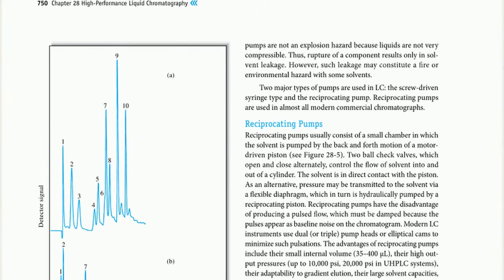The peaks clustered here on the left side, at lower retention times, represent the molecules that barely interacted with the column packing. They preferred the mobile liquid phase and washed out almost immediately. The spikes on the far right are the compounds that bonded heavily to the stationary phase. They required significantly more time and solvent to finally break free.